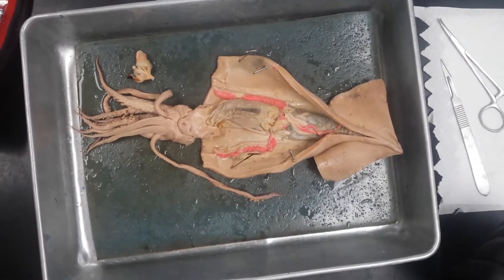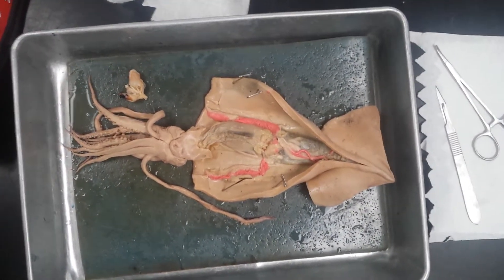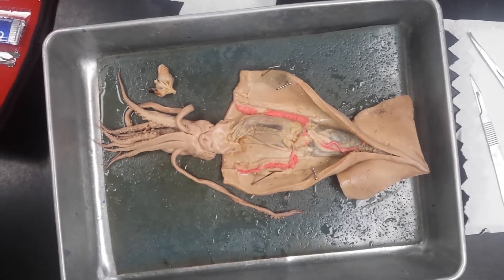Here we have a squid dissection for Bio 182 Zoology at Golden West College. We're looking at kingdom Animalia, phylum Mollusca, class Cephalopoda.